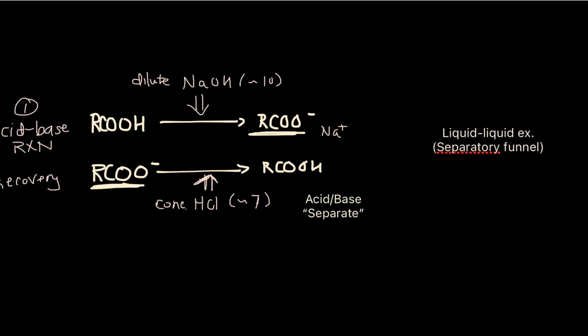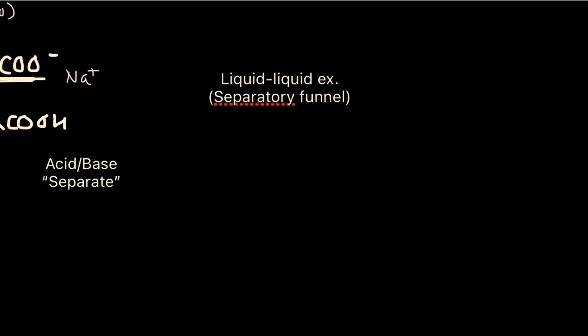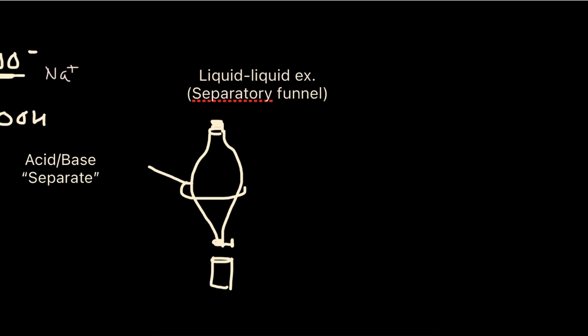Now let's talk about the procedures. Separatory funnel. Put it on a ring clamp, checking the stopcock and the stopper at the top, making sure to always have something at the bottom to catch it. Ring clamp. Okay, so let's say we already dumped our stuff in here.